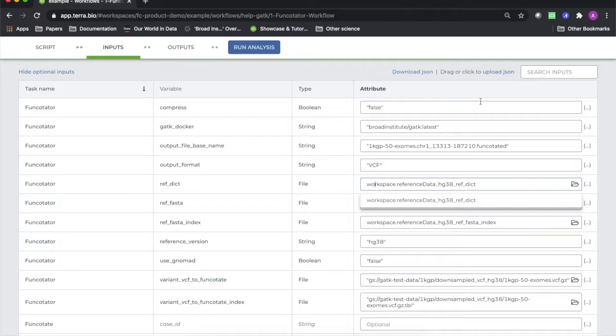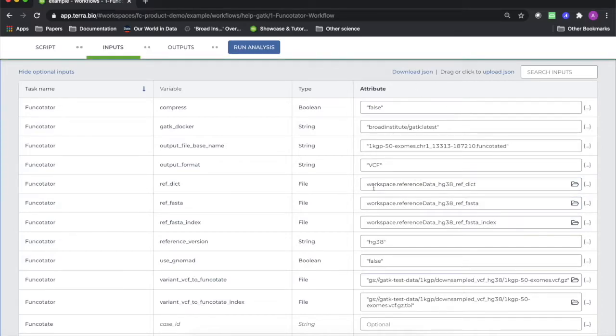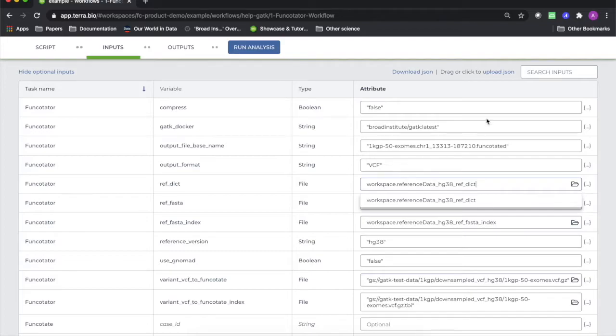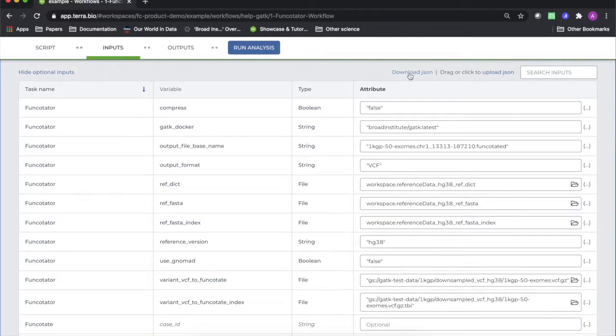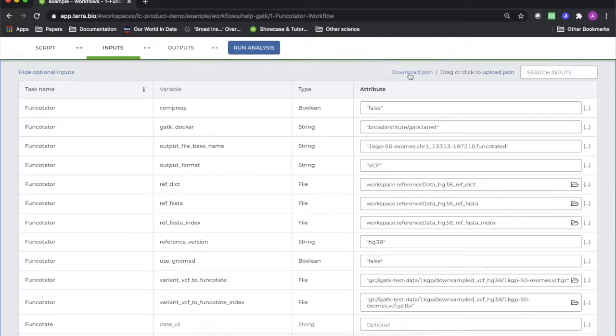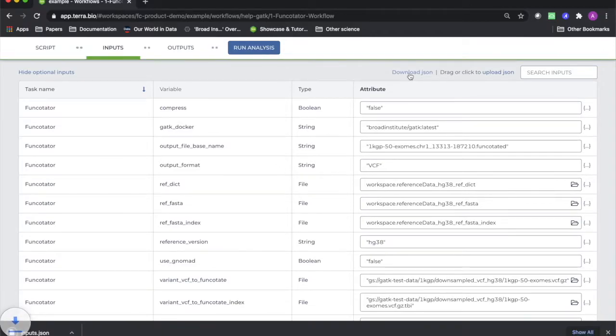One simple way to save a configuration is to find a preconfigured public workflow like this one and download the JSON file. I'm going to download this one to use later in this video.